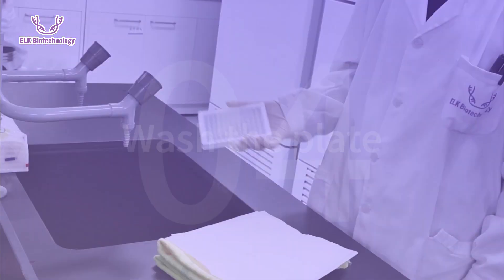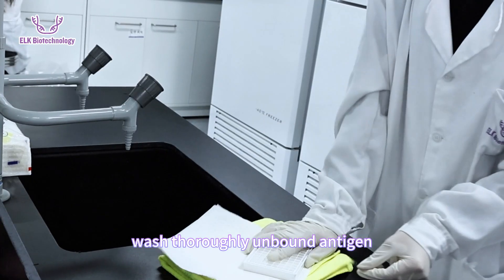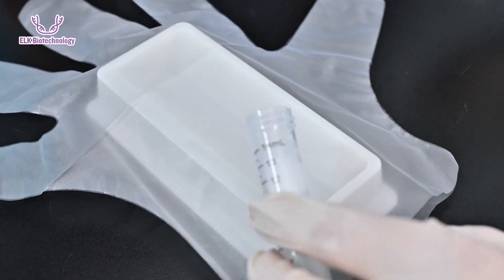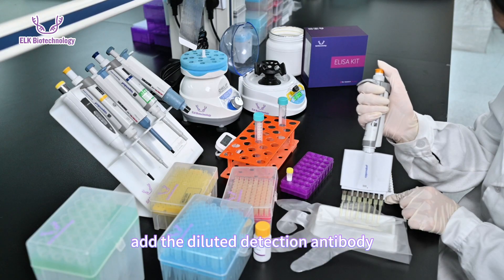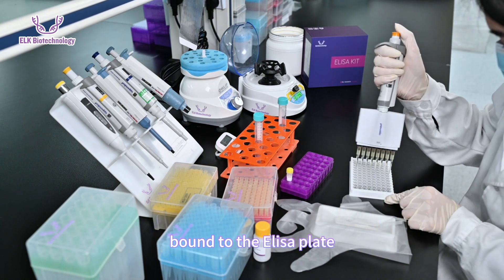Once incubation is completed, wash the plate three times. This step is very critical — wash thoroughly to remove unbound antigen. After washing, add the diluted detection antibody, which will specifically bind to the antigen bound to the ELISA plate.